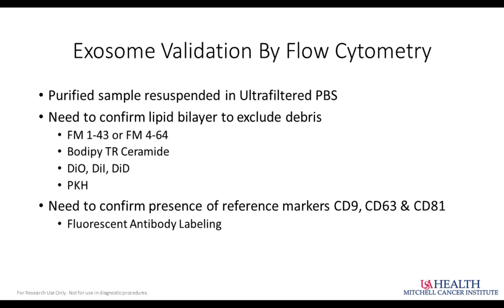And PKH has actually been made into a whole rainbow of colors. I think there's actually 8 different fluorescent molecules across the whole span of the range that a cytometer can detect.